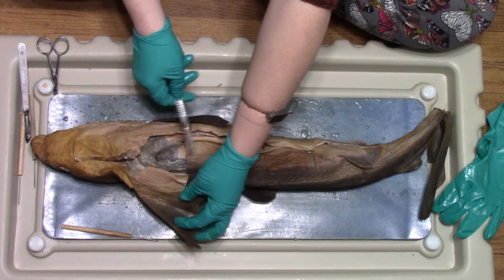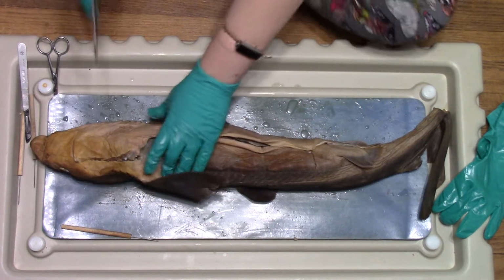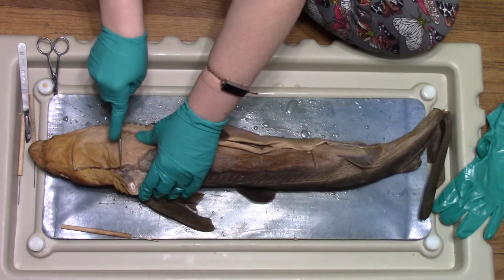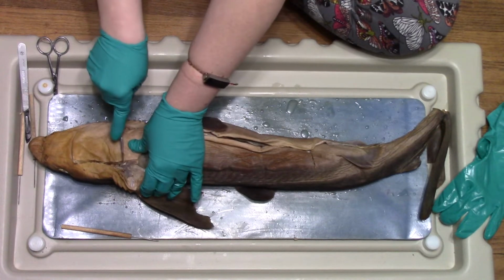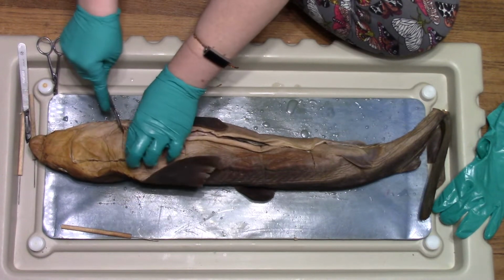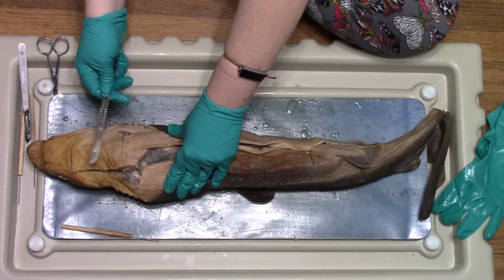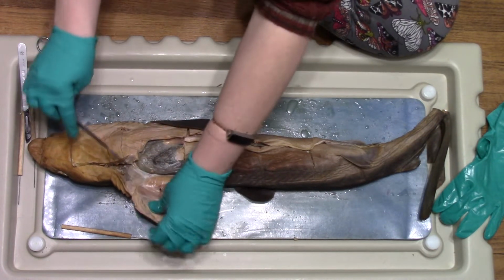Some textbooks have you cutting below the pectoral fin and others have you cutting above. So I'm going to try making a cut here and seeing if that helps. I'm being a little bit tentative about where I cut here because the shark's heart is right here. So I don't want to destroy that organ so you guys can't see it.